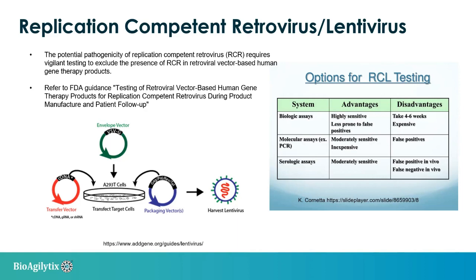However, compared to cell culture-based assay, the PCR method is much quicker. From DNA extraction to PCR, it takes only a couple of hours to get the results. It is also fairly sensitive. Therefore, the PCR-based assay is an alternative for rapid assessment of RCR and RCL in final products.